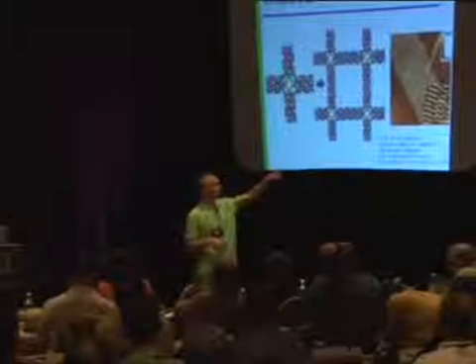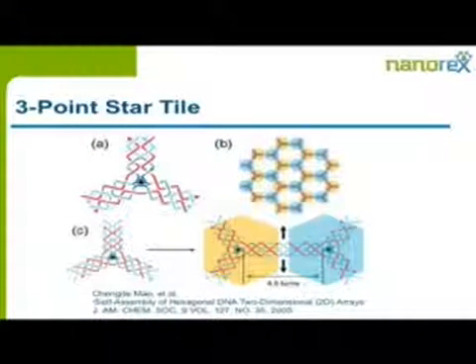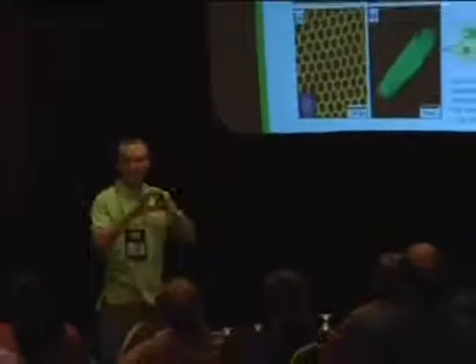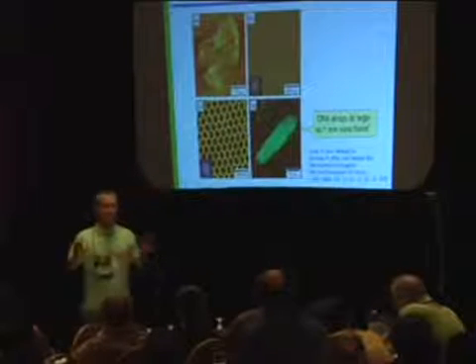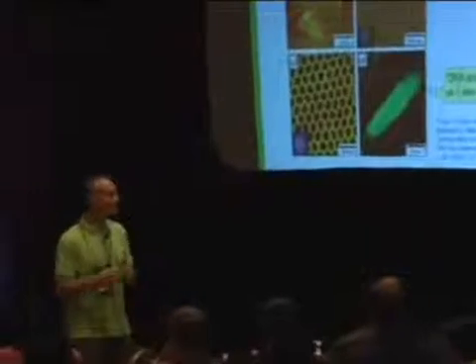And this is an actual atomic force microscope image of this structure, and you can see that these things get very large. And in fact, I believe on the next slide, this is the three-point star up here, and here's an AFM image showing the honeycomb grid that this motif creates in solution, and they've actually measured the size of grids made of this. It really creates a kind of film that is 1 millimeter in length. And it's just amazing to me that we're synthesizing structures this large with literally millions of atoms in them, where the atoms in the structure are exactly where the engineer, the chemist, the technologist wanted them.